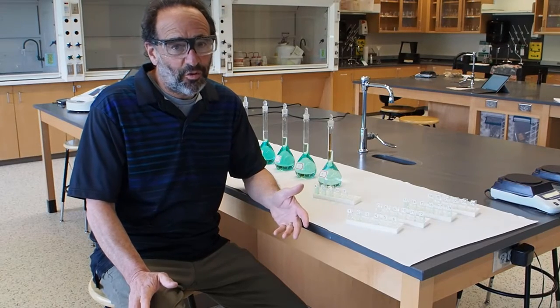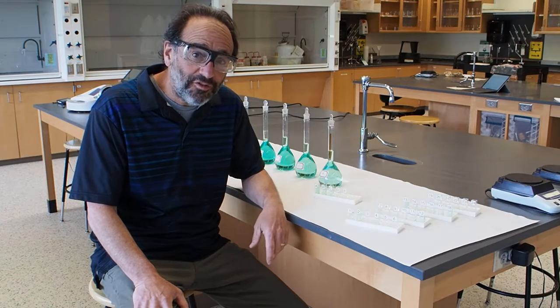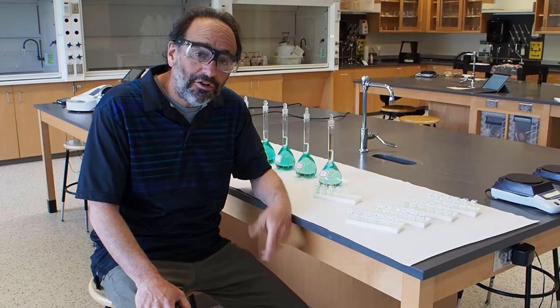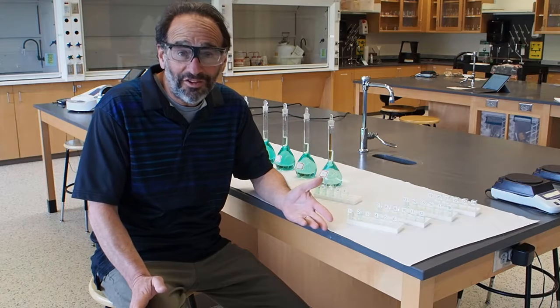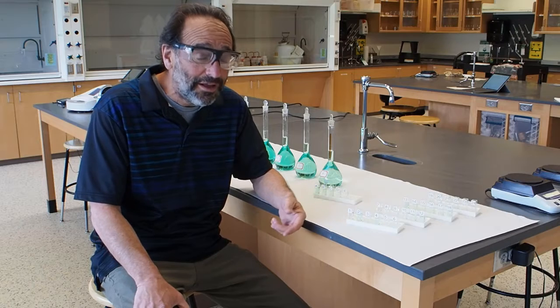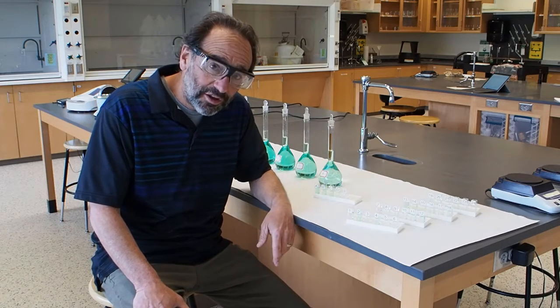So as we said, this is a quantification experiment, and our goal is to figure out the concentration of nickel 2+ in each of these 24 different samples. And to do that, we're going to use a method where we develop what's called a standard curve. One of the things you'll find out about standard curves is that they're almost always straight lines. So not really curves, but we're going to make a standard curve and then use that to determine the concentration of nickel for each of these.